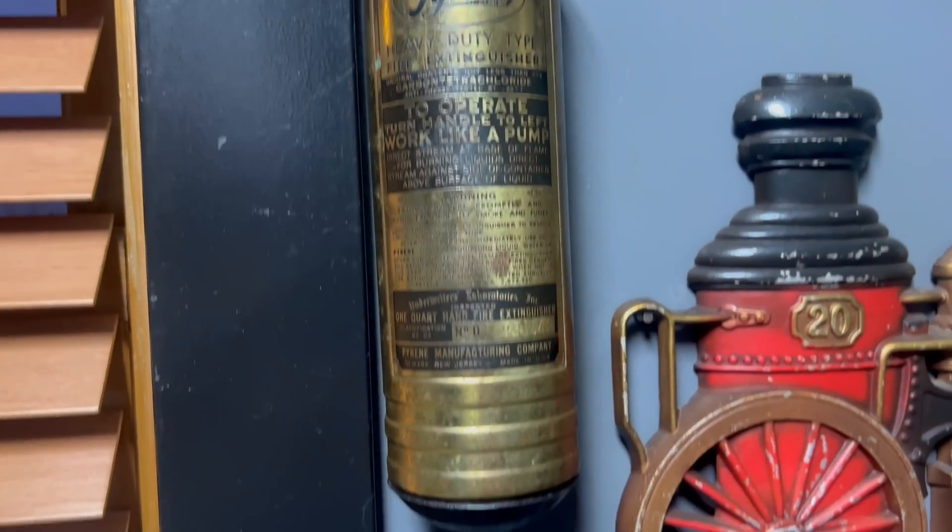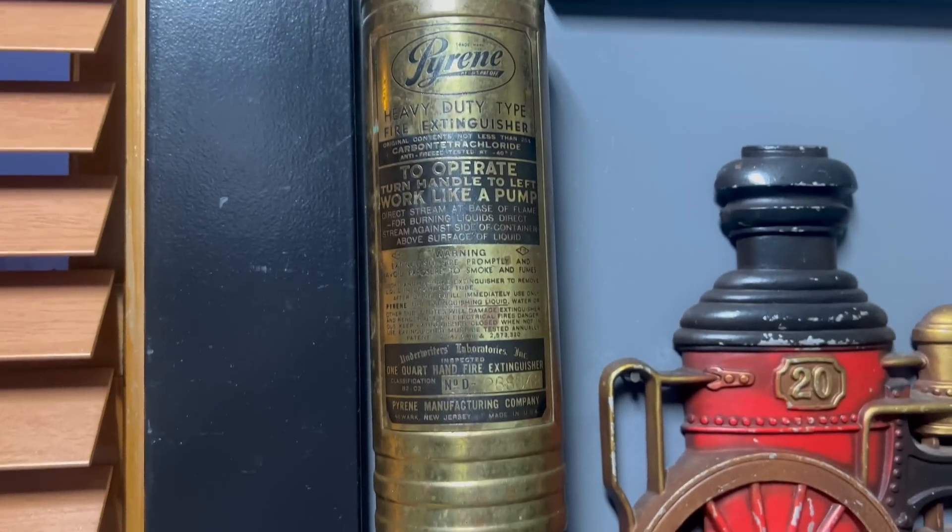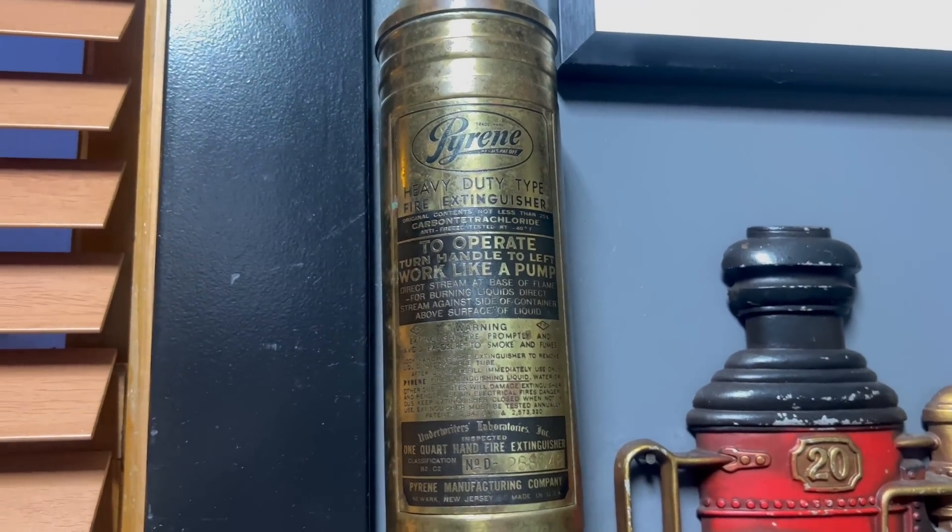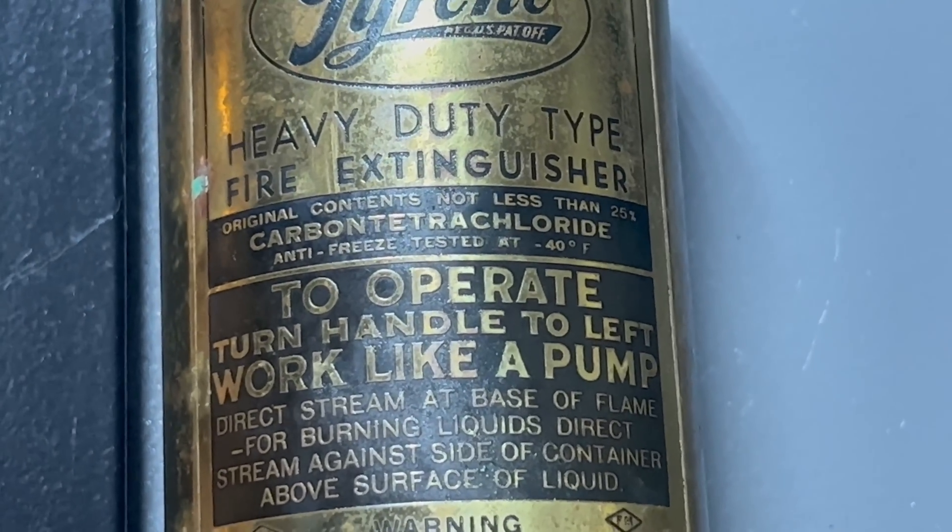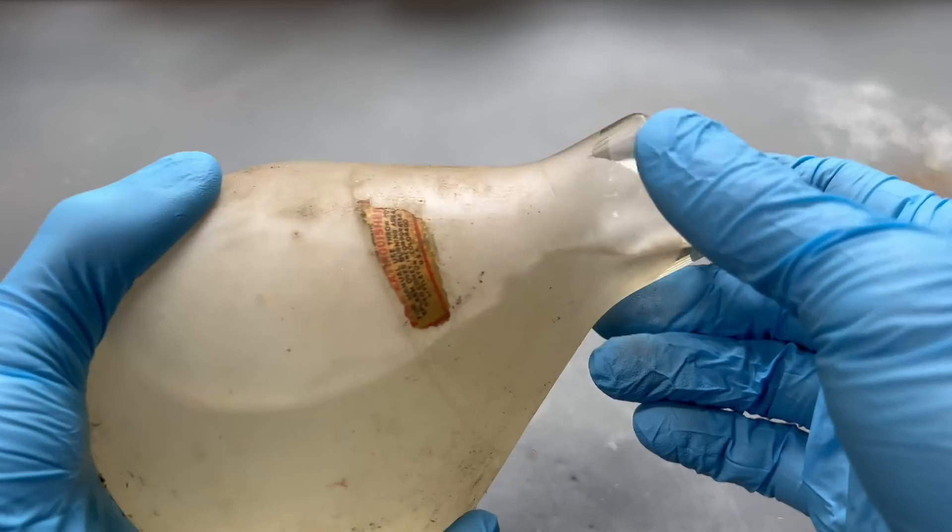A few different styles of extinguishers exist that contain carbon tetrachloride. The two main styles are a brass style, which is just a cancer squirt gun, and the other is the glorious fire extinguisher grenade.